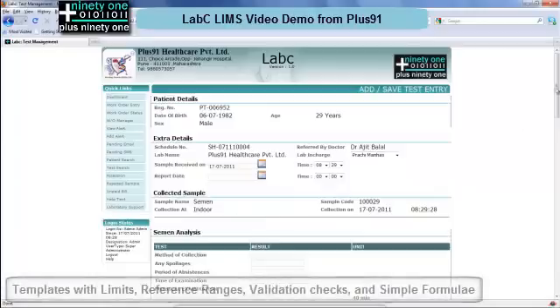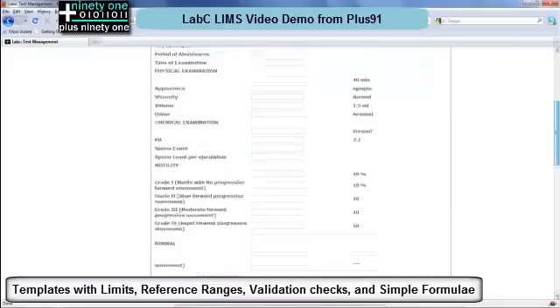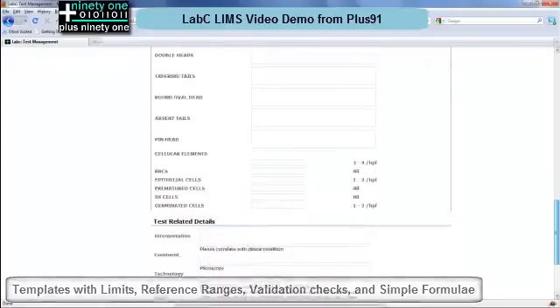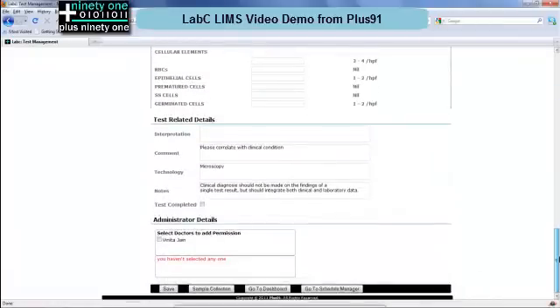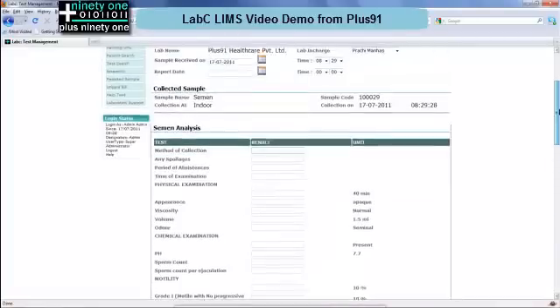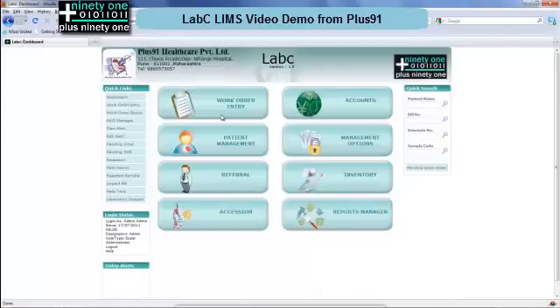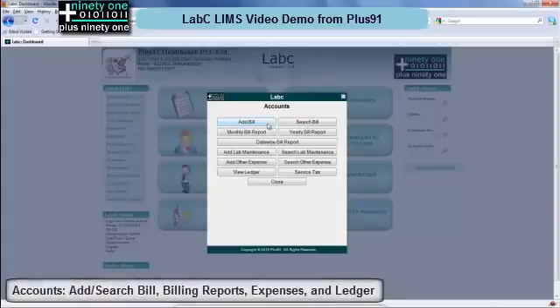You can also access the test template from here. Here we are showing you a much larger test template. There are over 480 built-in test templates in LabC. You can also create your own or update an existing one.